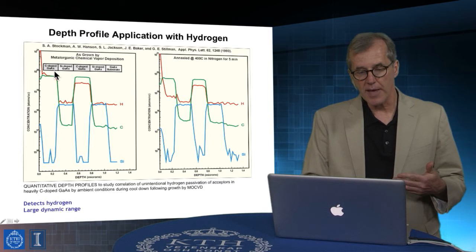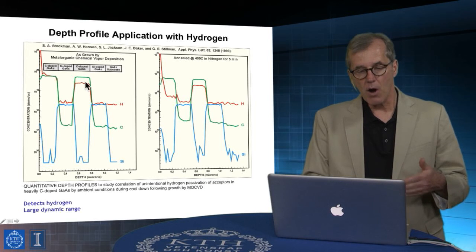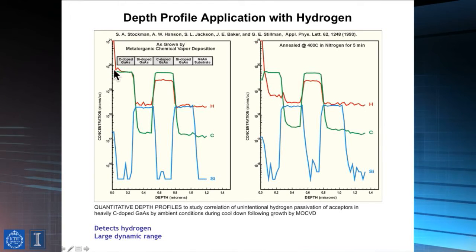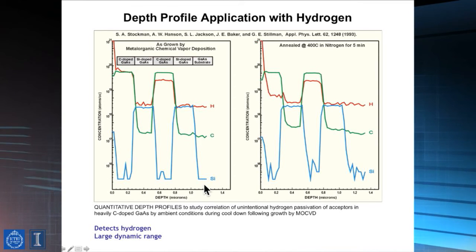And what you notice is that in all the regions associated with several layers of the carbon-doped region, there are, in fact, significant densities of entrained hydrogen atoms that are also present in that phase. And we also can see, for example, the anti-correlated silicon composition of this other component.